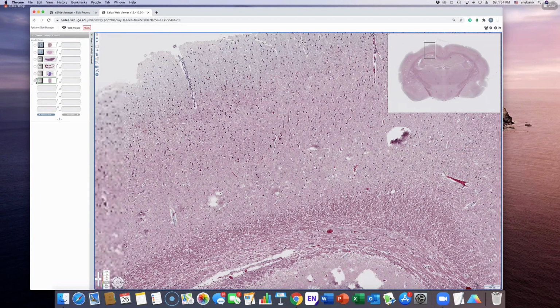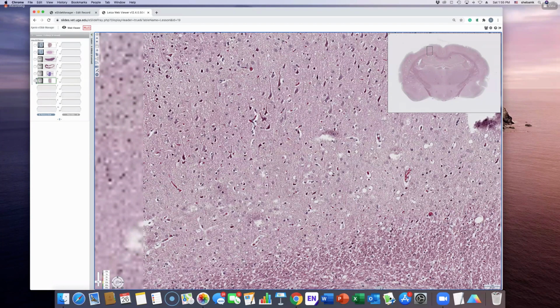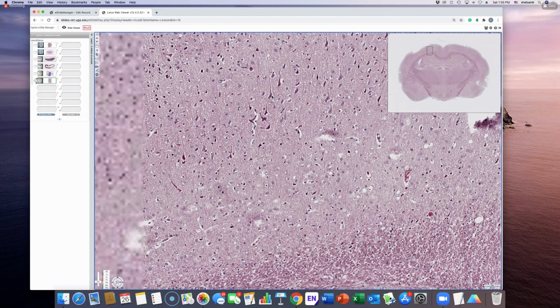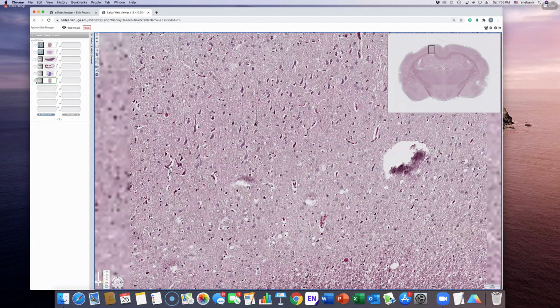There are different types of neurons here. Who are these guys? They are neurons. What type of neurons? They have a specific name, right? Are those pyramidal? Yes, these are all pyramidal neurons.